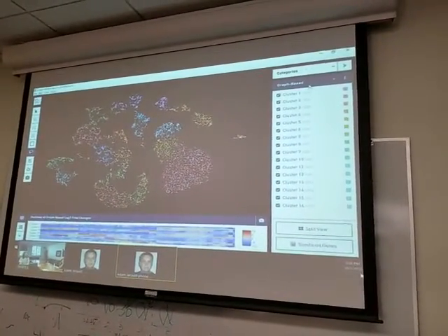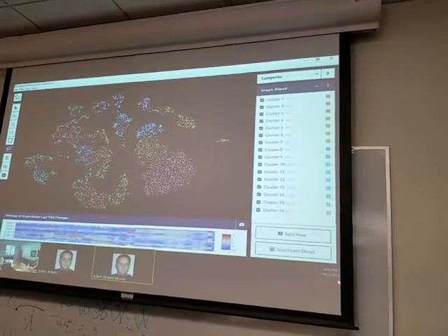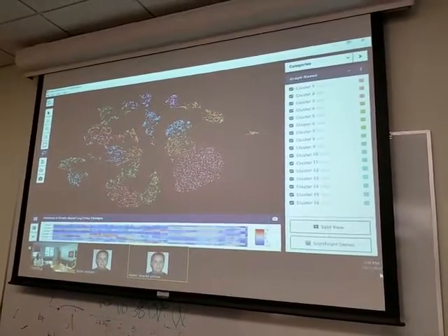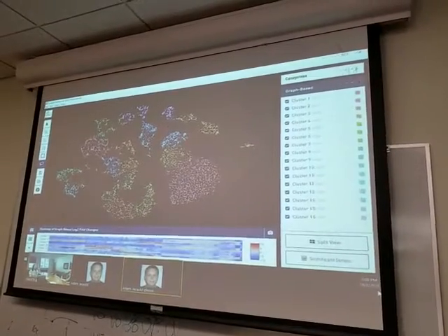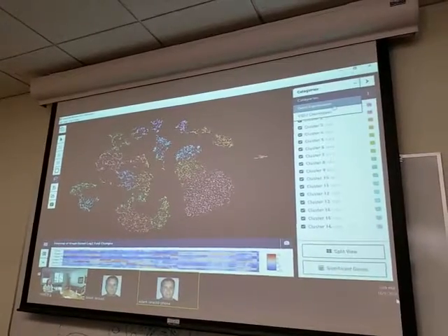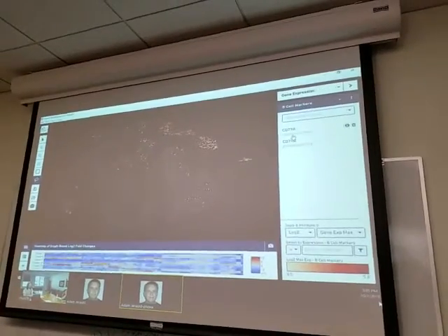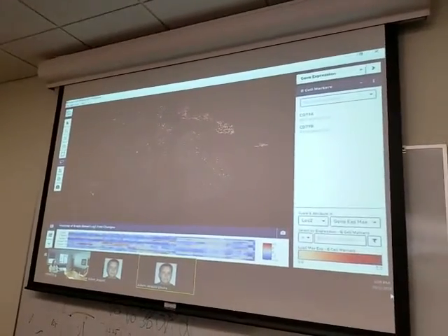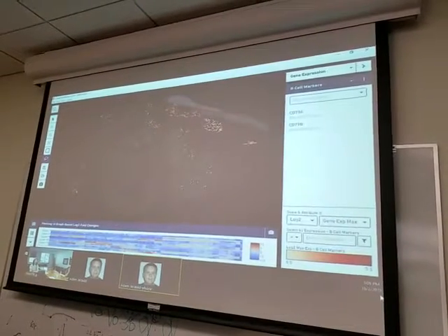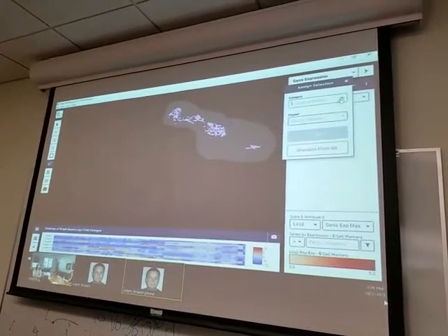Right, okay. So you can see the list of the different clusters. So this data set is clustered purely on whatever's being expressed. So right now looking at this, I have no idea what types of cells these are. It's only when I go in and look for particular markers. Oh, I see. CD79. That's what I was thinking. So I got CD79 alpha data. And so now I have more confidence to somewhat subjectively isolate these cells and say that these are B cells.